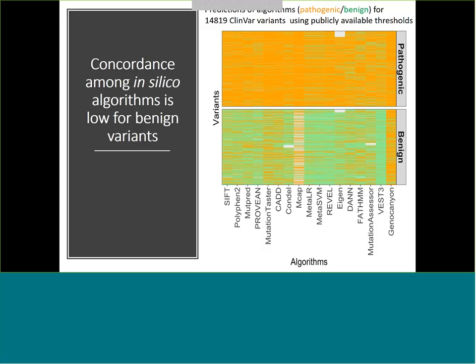Yeah, so those are the ones where you can actually adjust your thresholds? Actually, that is an ideal way of doing things once you have chosen the algorithm. If you have enough known benign and pathogenic variants for a given gene, you would have essentially all the tools to calibrate the threshold for your algorithm and test new variants in that gene. That could be done for any gene and any algorithm, and you could get a threshold. But in the interest of time, I am just showing how you would use one.